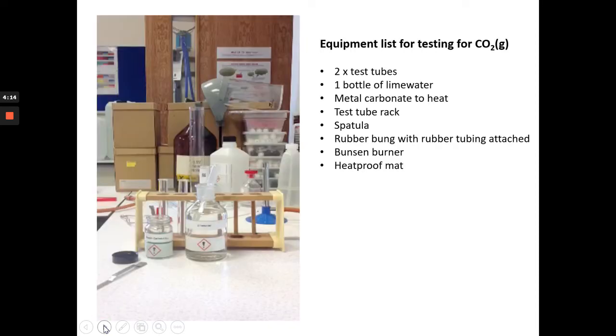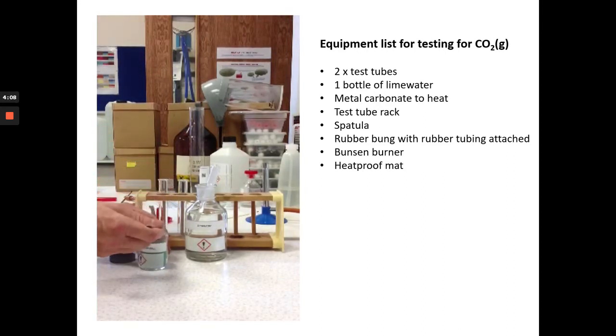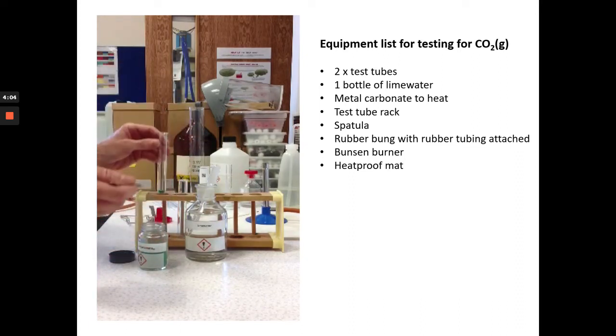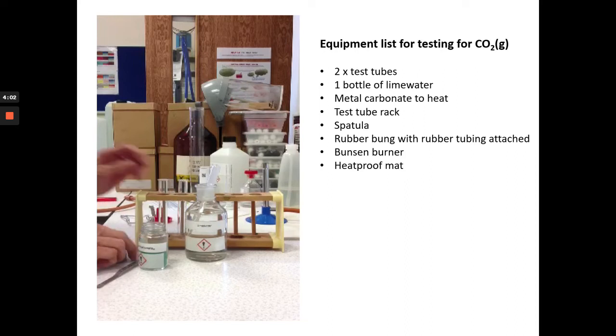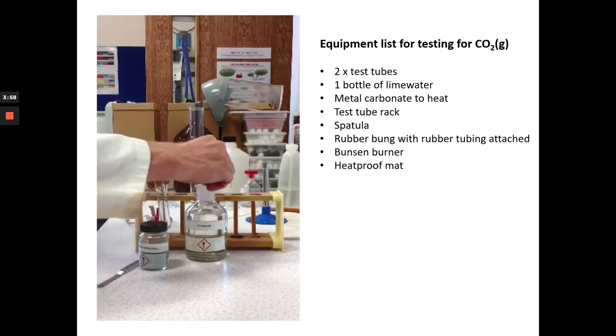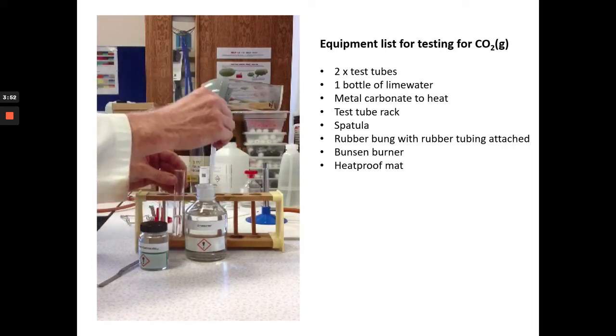So I'm going to take you through how to set it up. Using the equipment list on the right, you take your copper carbonate and put it into a test tube in a rack, and you can see I've got a stock bottle of lime water as well. You put some of that into the other test tube. I'll show you how to set it up so you can test for the presence of carbon dioxide once the reaction is underway.